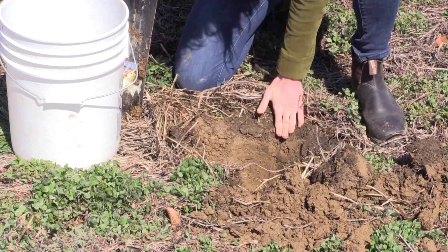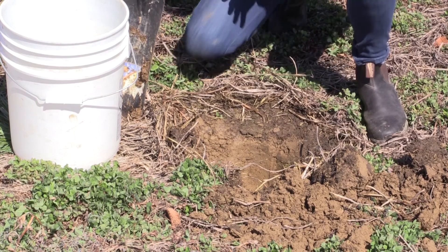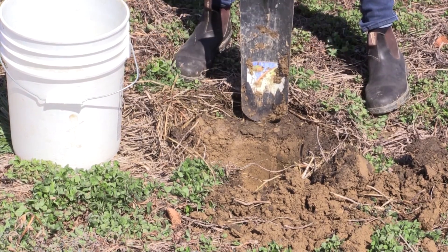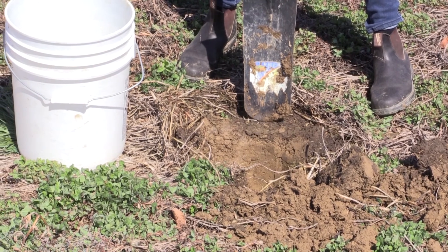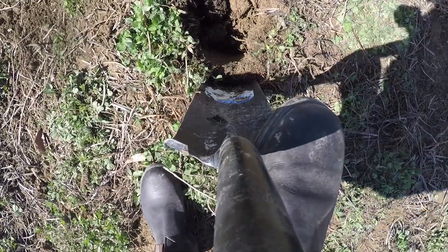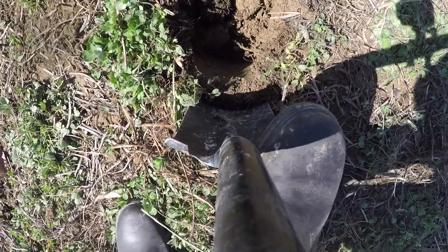I've got about an 8-inch hole. Now I'm going to take what we call a slice of bread from the edge of the hole — about 2 inches thick by about the shovel wide and 6 inches deep.